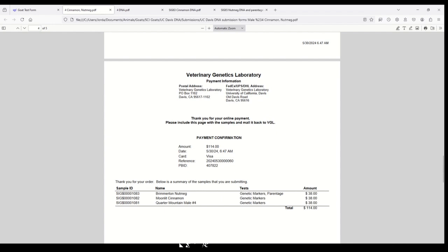When they receive your tests, you're going to get an email for each sample you sent in that says your sample has been received. And that's when the clock is going to start. If they said 24 business days from the time they receive it, here's your notification. And you should get one separate notification for each sample. Then let's say those 24 days go by, and they're going to email you your results, and I believe SCI-GBA will get a copy as well because you chose us as your affiliation. So we will have that record and you will have it.